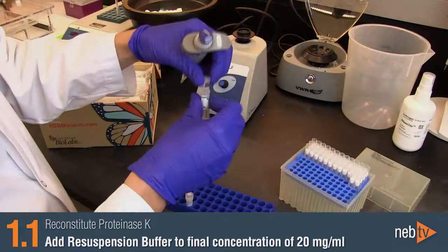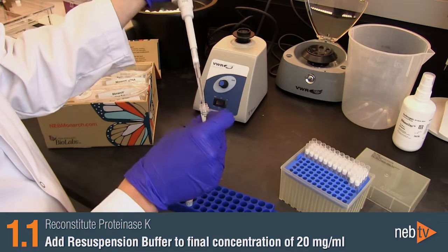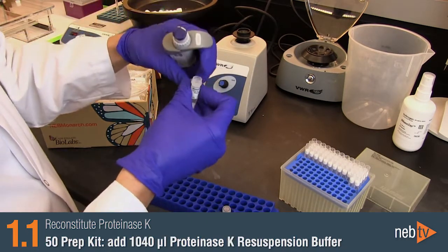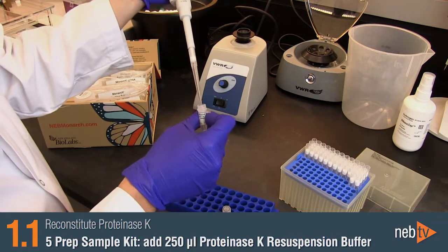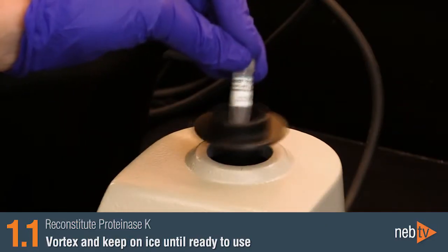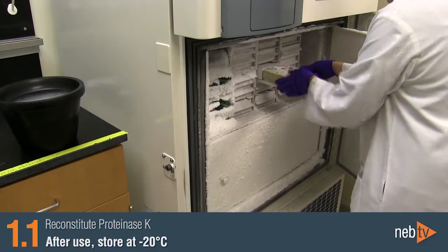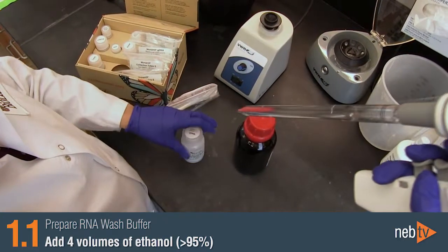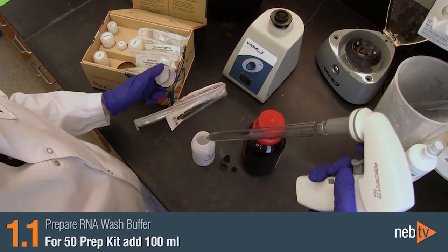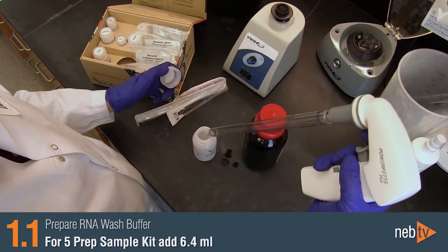Reconstitute the Proteinase-K by adding Proteinase-K resuspension buffer to bring the final concentration to 20 mg per mL. For the 50-prep kit, add 1,040 microliters, and for the 5-prep sample kit, add 250 microliters. Vortex to mix and keep on ice until ready to use. After use, store at minus 20. Add four volumes of ethanol, greater than 95%, to the RNA wash buffer concentrate — 100 mL for the 50-prep kit, and 6.4 mL for the 5-prep sample kit.